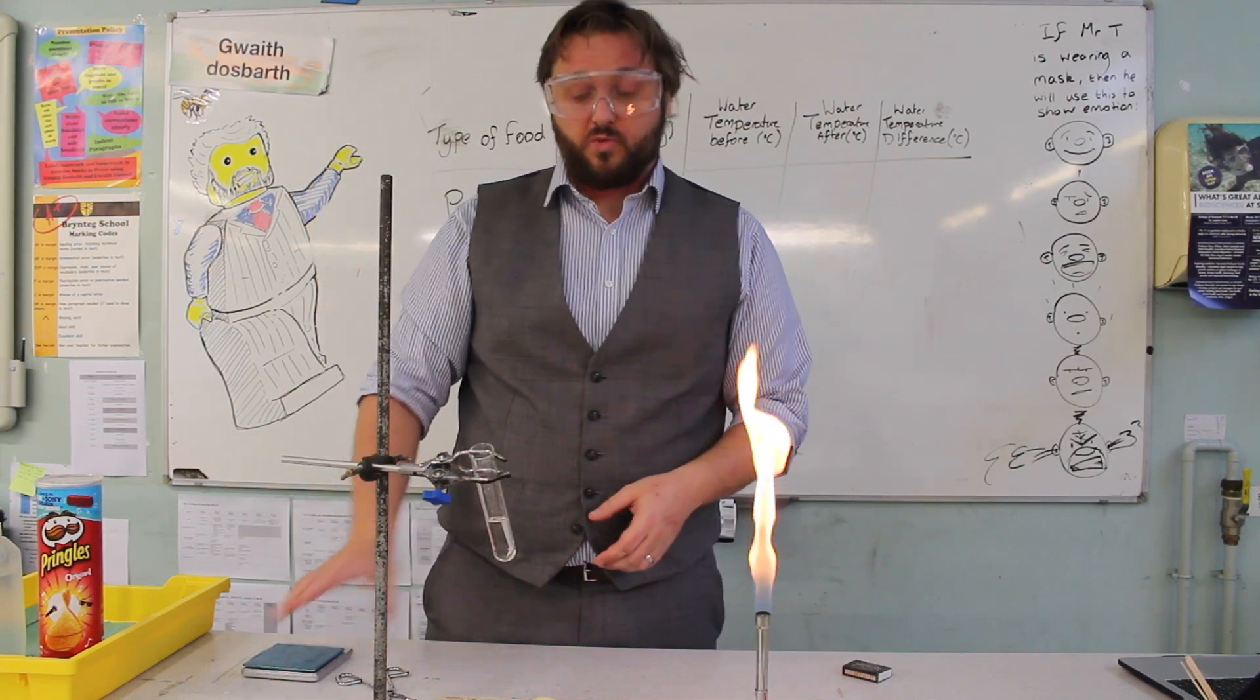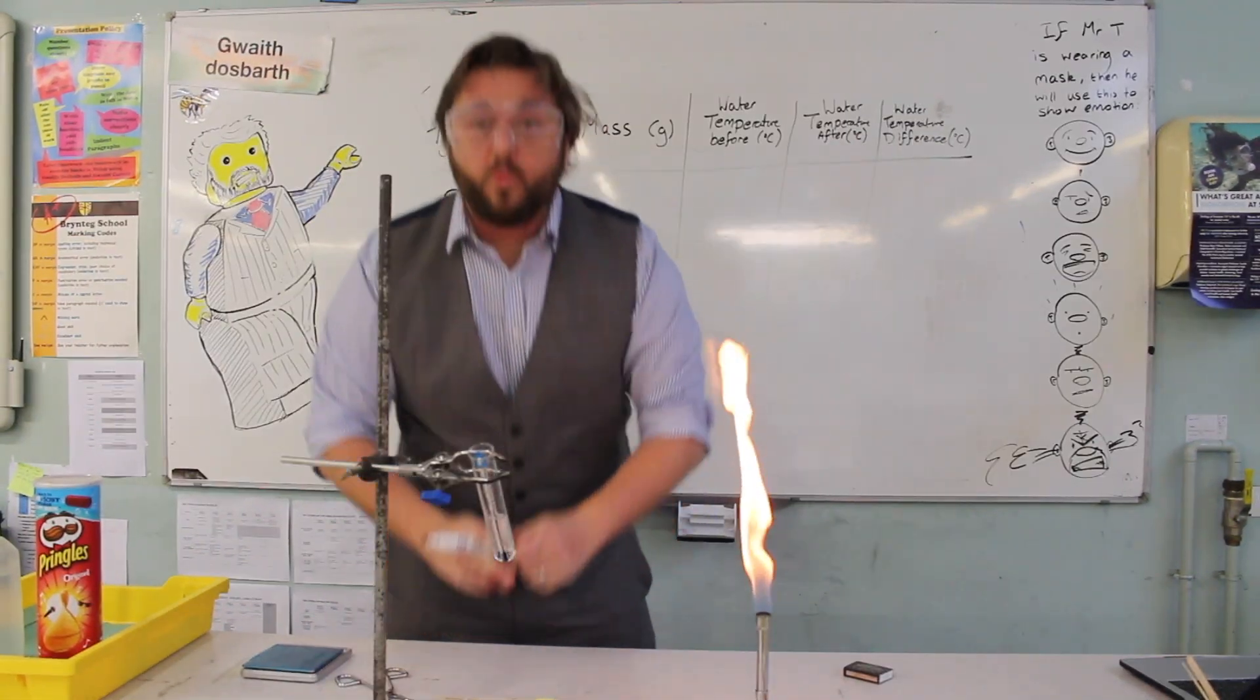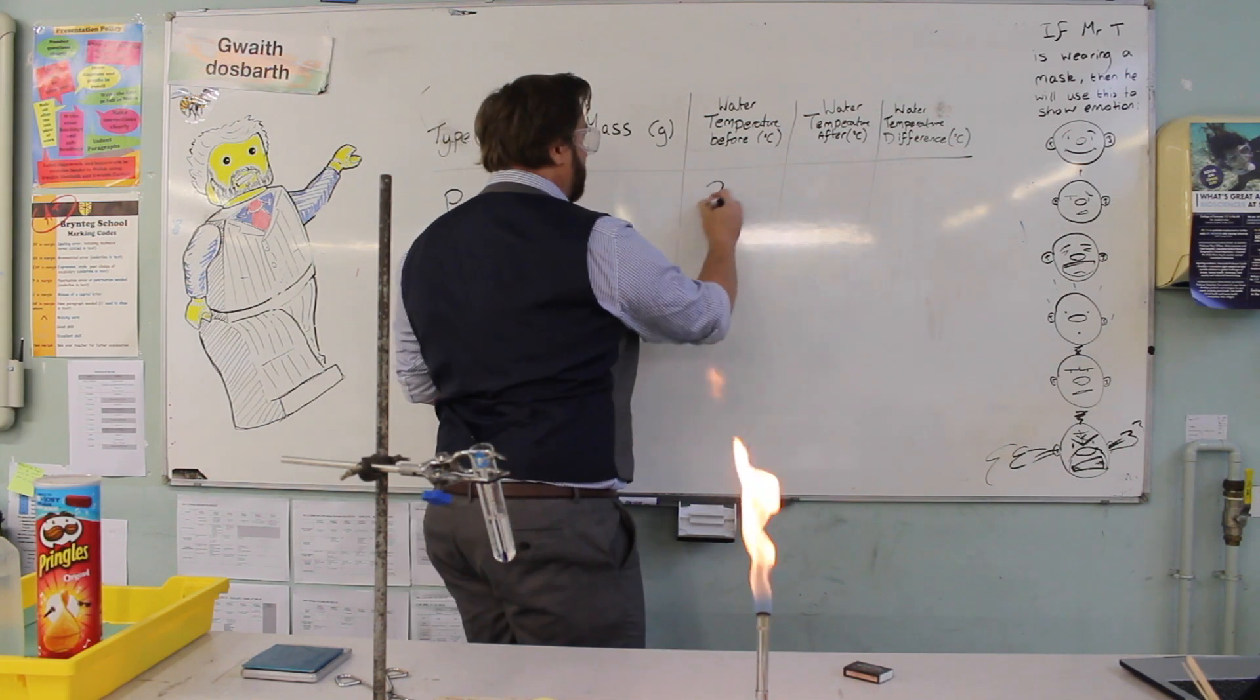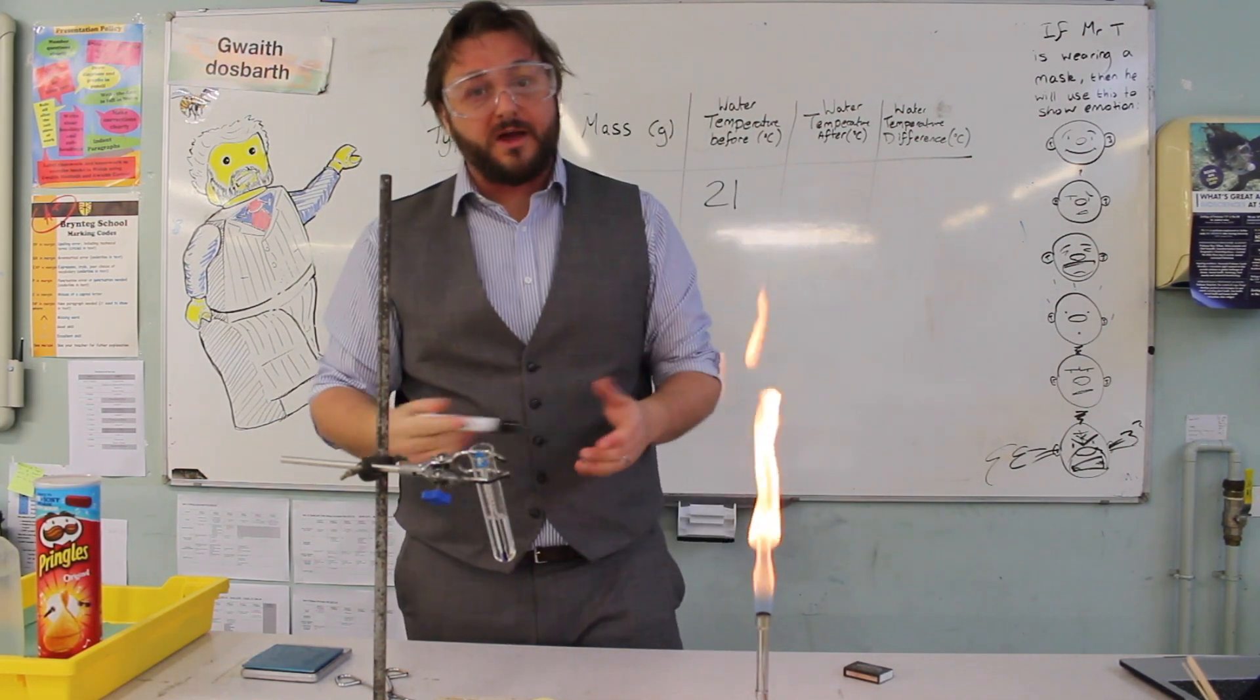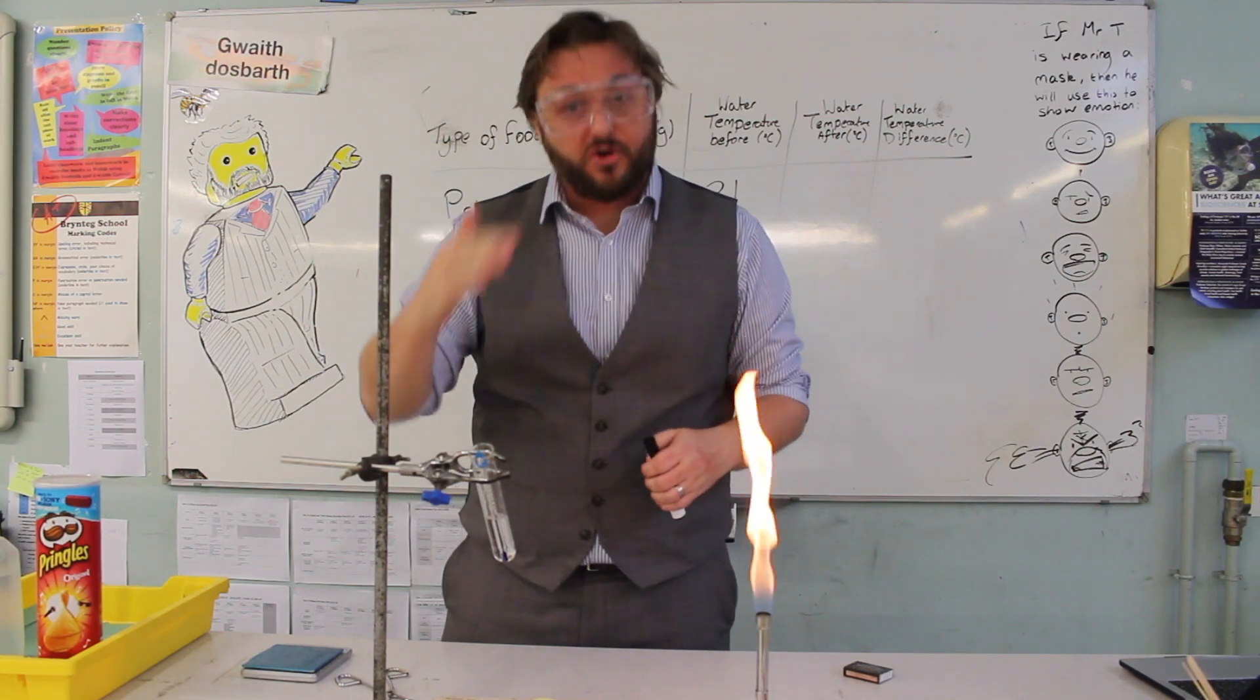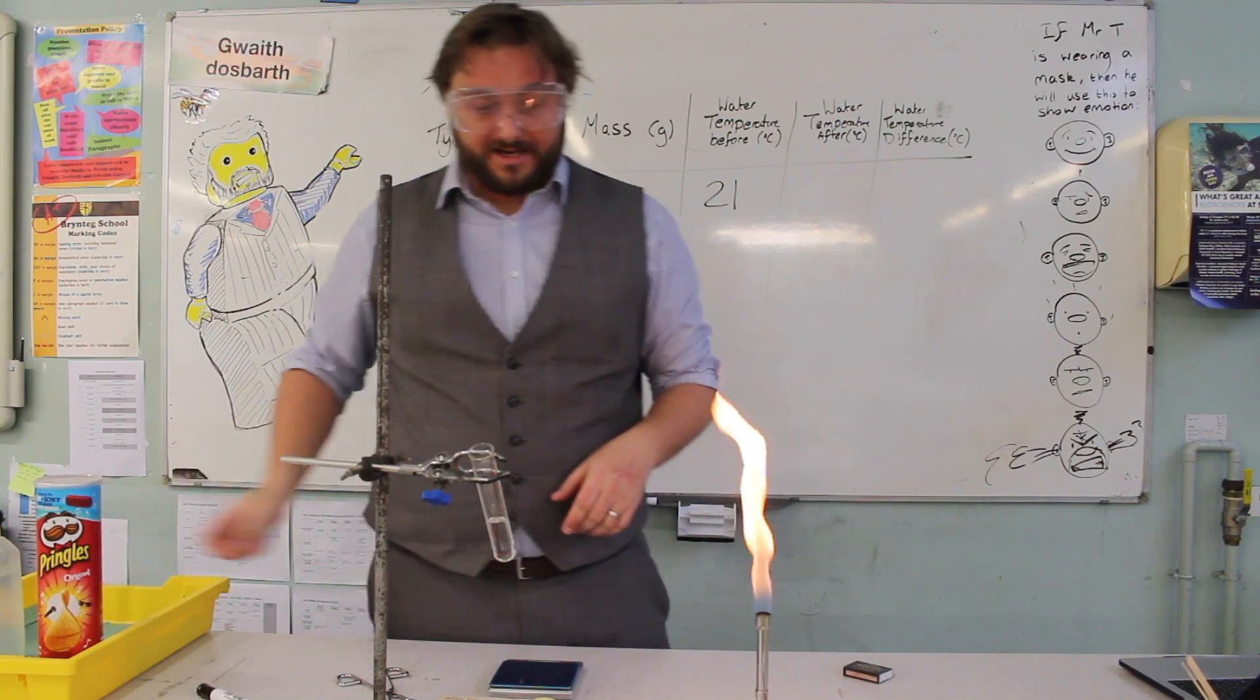Once we've sorted our water, there's a few measurements we're going to need to take. The first is the temperature of the water. So our water is starting off at 21 degrees centigrade. It's important to know that because we are ultimately measuring the increase in the temperature of the water. We're going to take our thermometer out, we'll put it back in later.